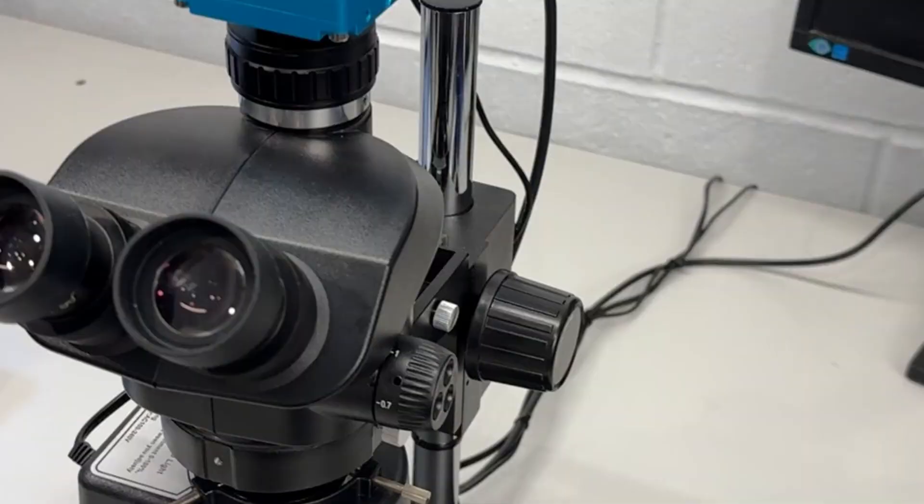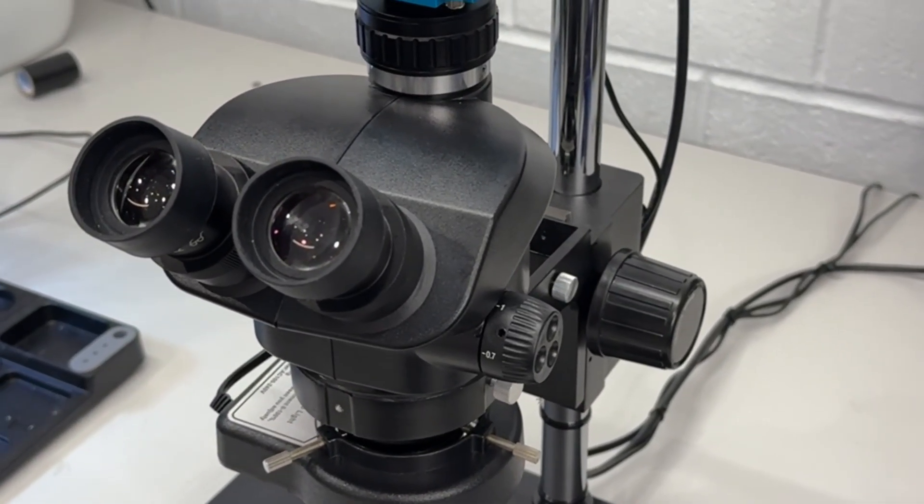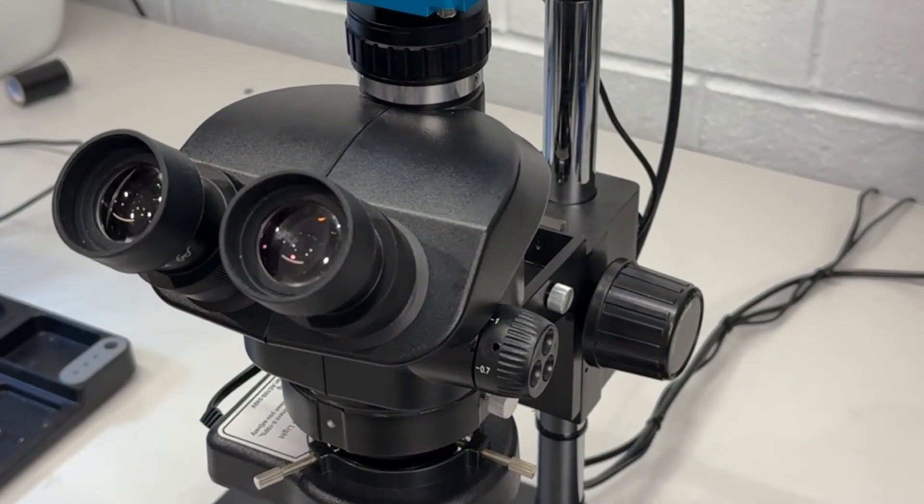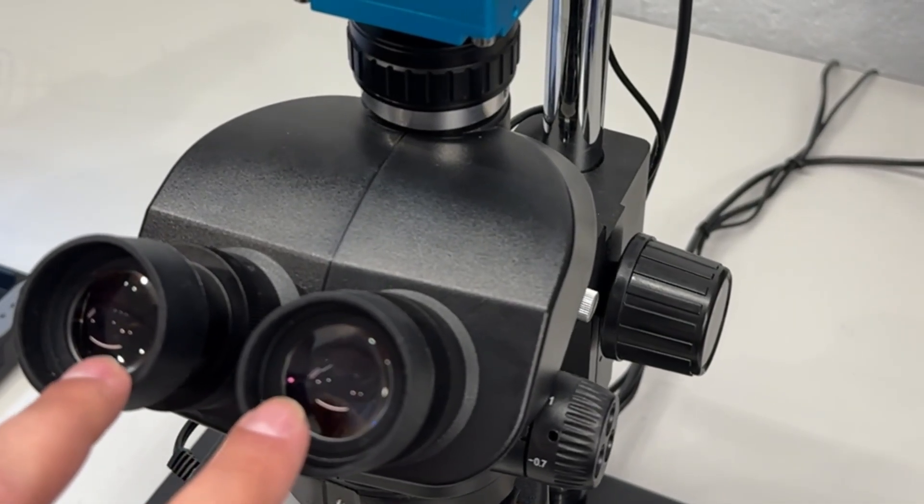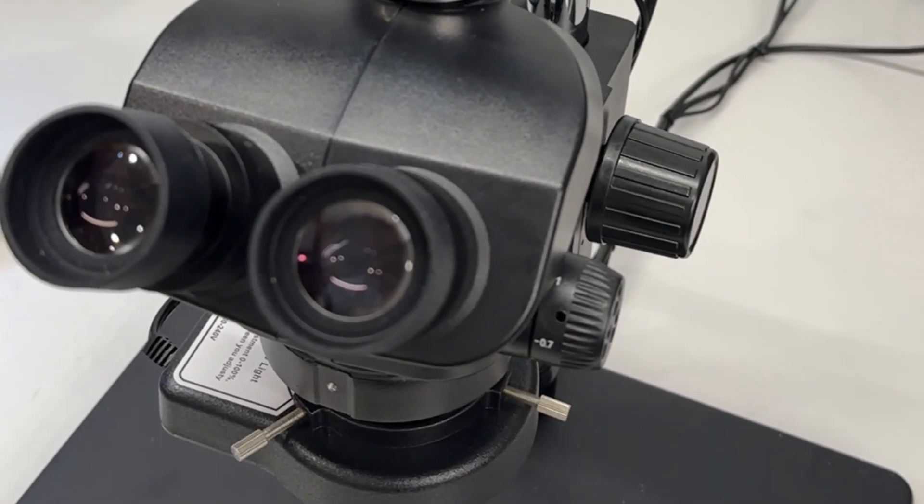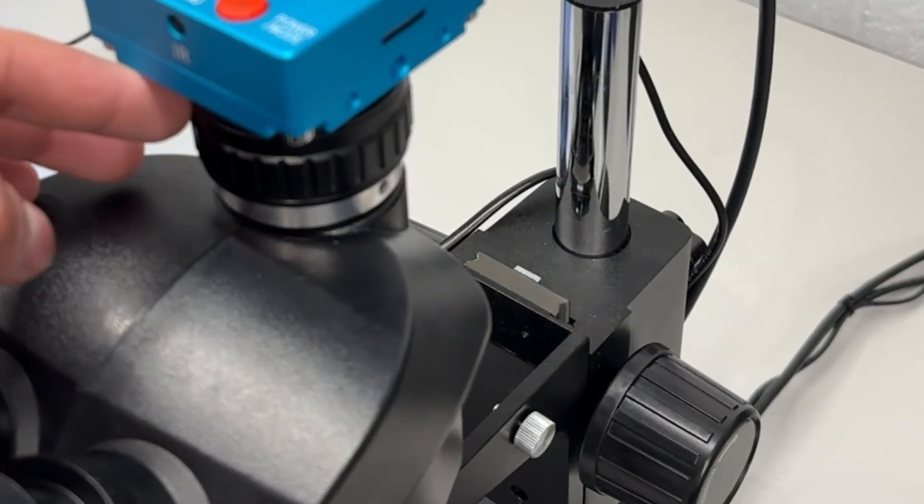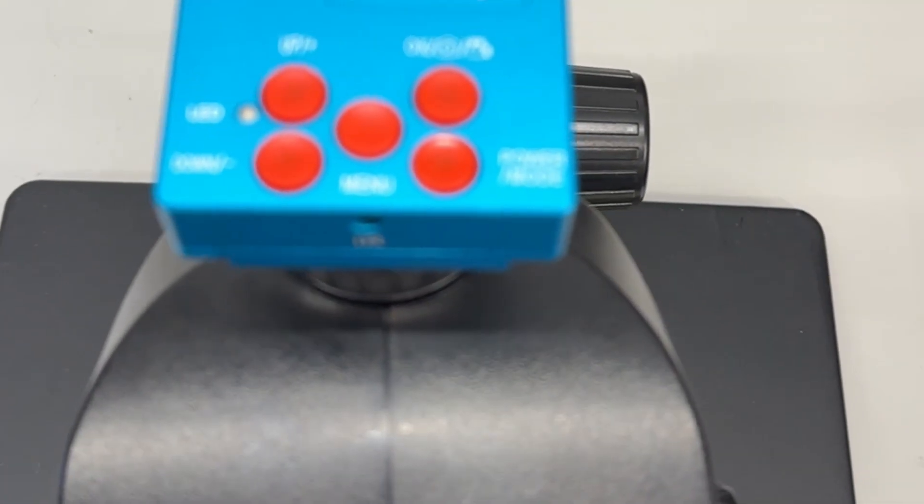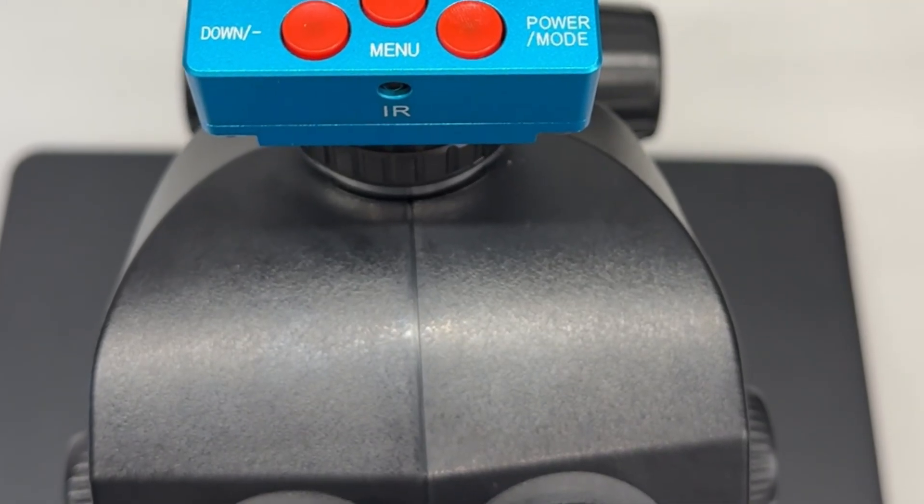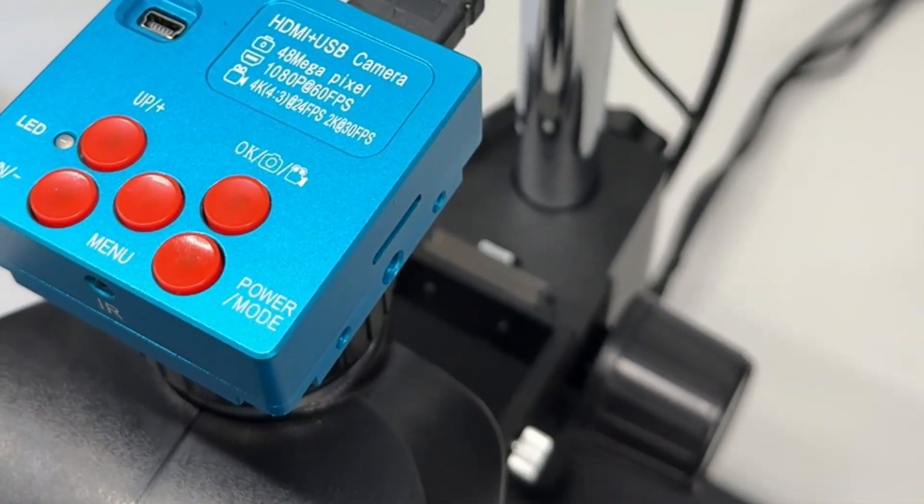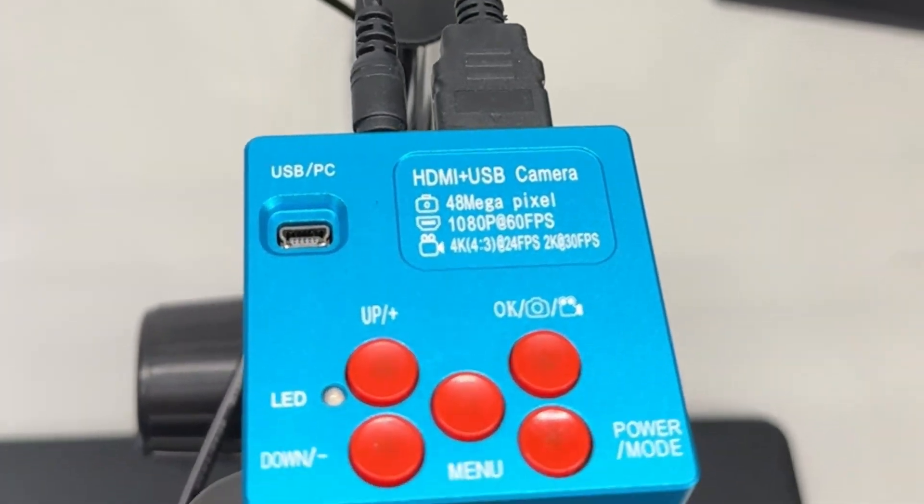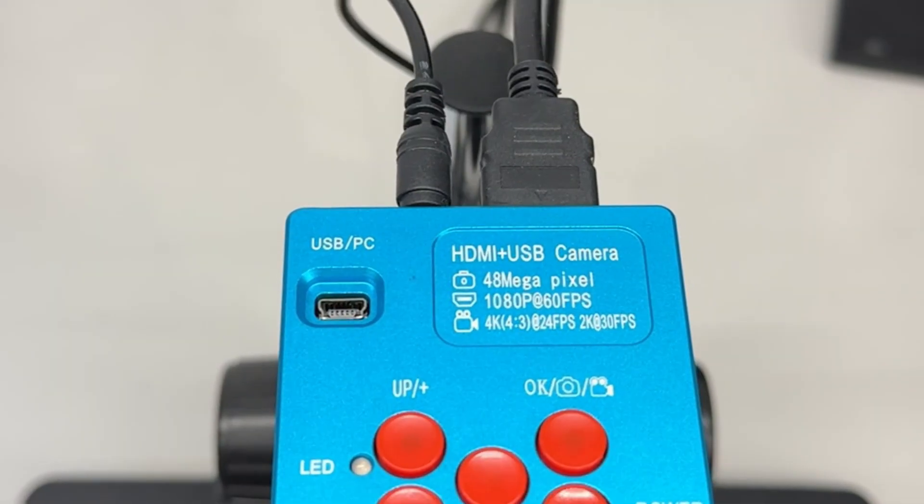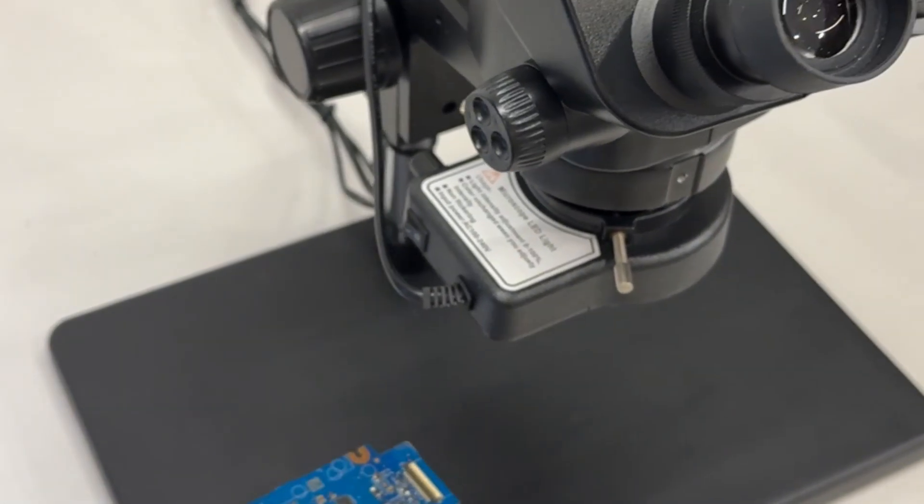So what's special about this microscope is that it's a trinocular microscope. Obviously you have seen a binocular one which has only got these two lenses on top where you can see the objects, but this has got a third lens for the camera. What you see on top is a little camera which is a 4k camera. It has also got an HDMI port so you can hook up a monitor, and also it's got the power input and a USB port, but I haven't used it.